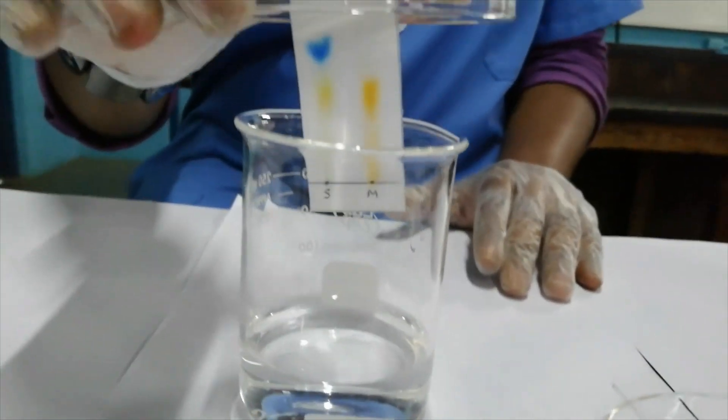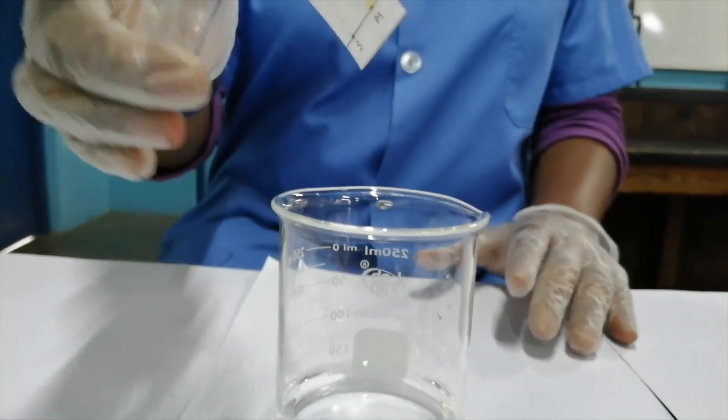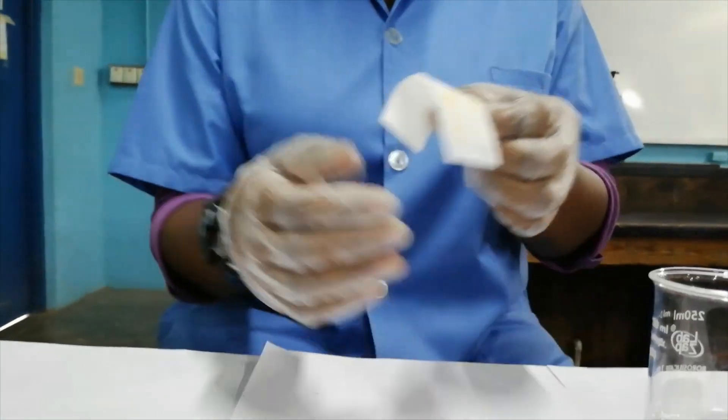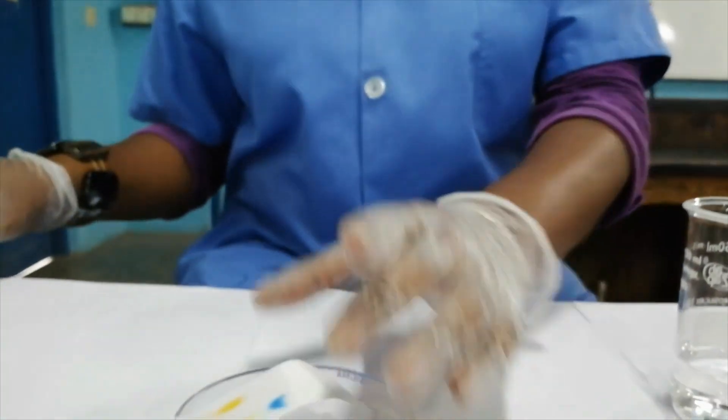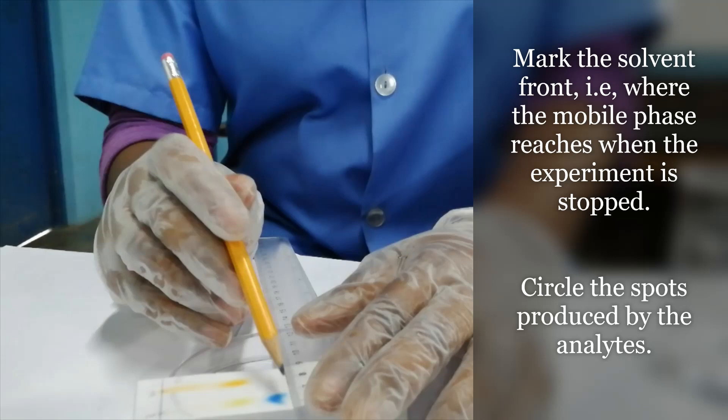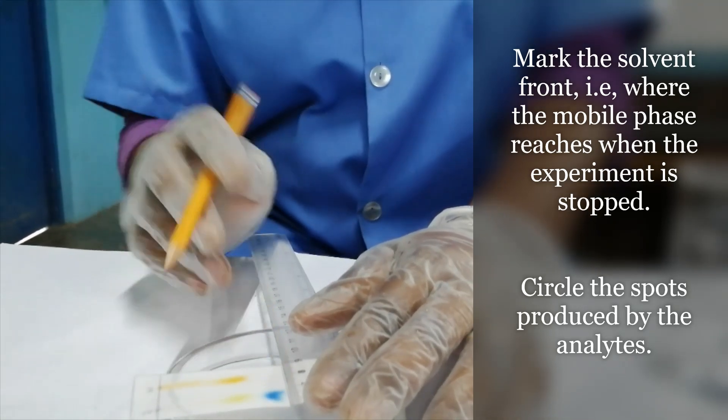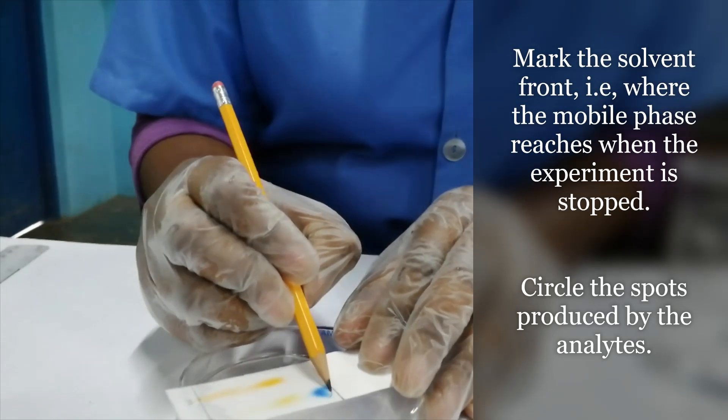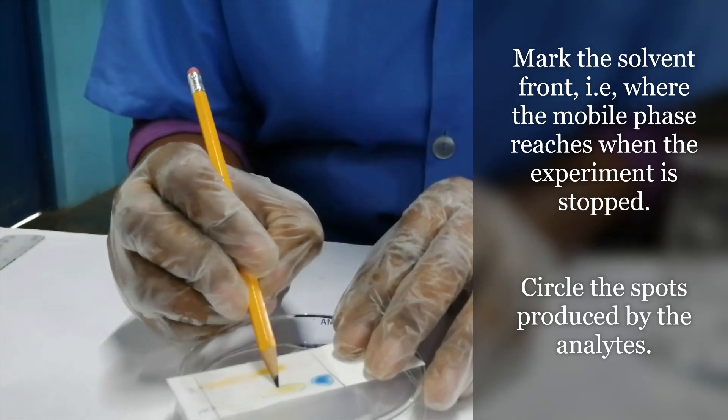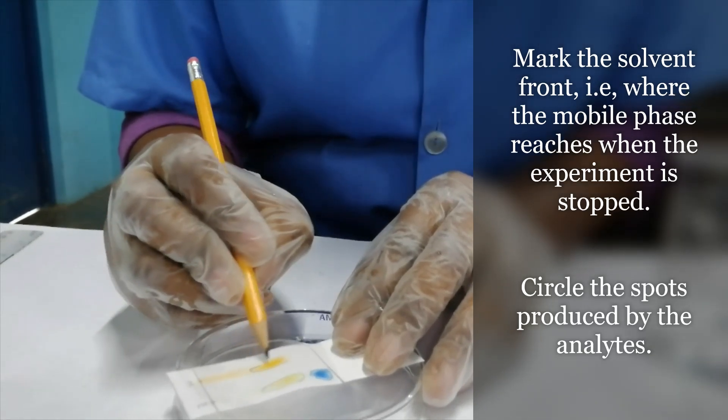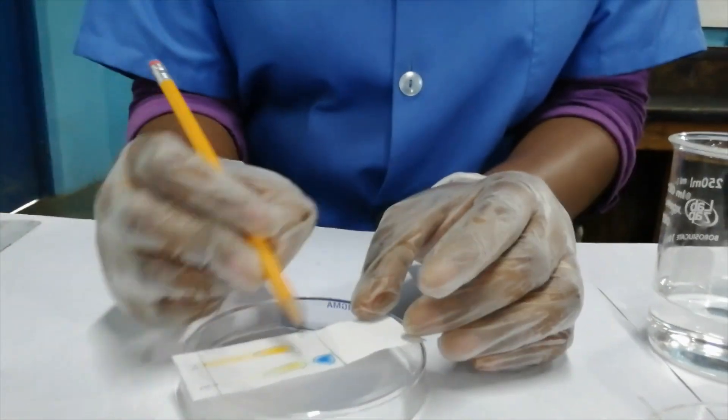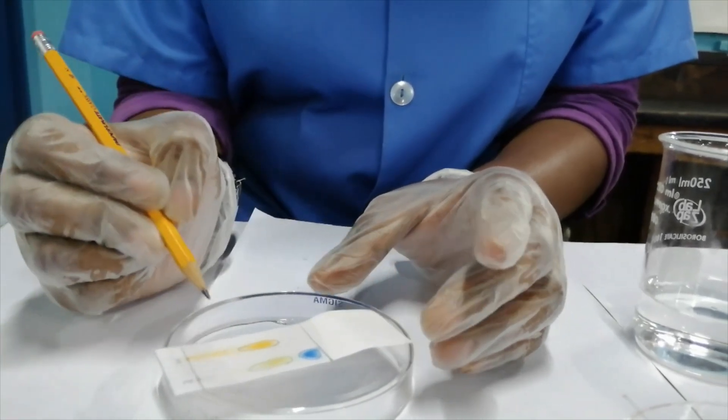I'm going to stop it by removing the filter paper from solution. I need to mark the solvent front. This is where the solvent reaches. I'm going to circle these streaks because once the paper is wet, it is going to continue developing.